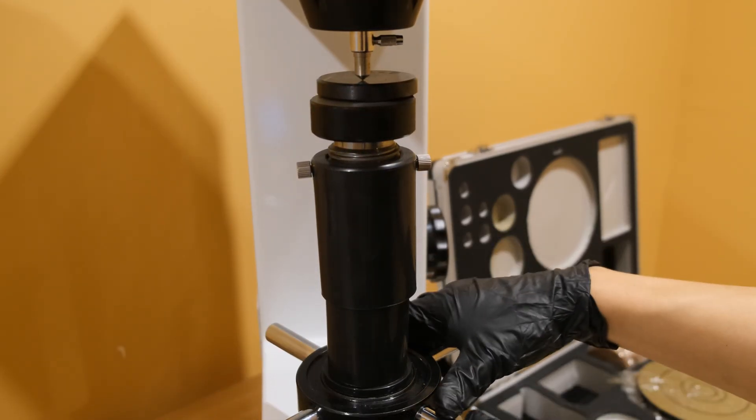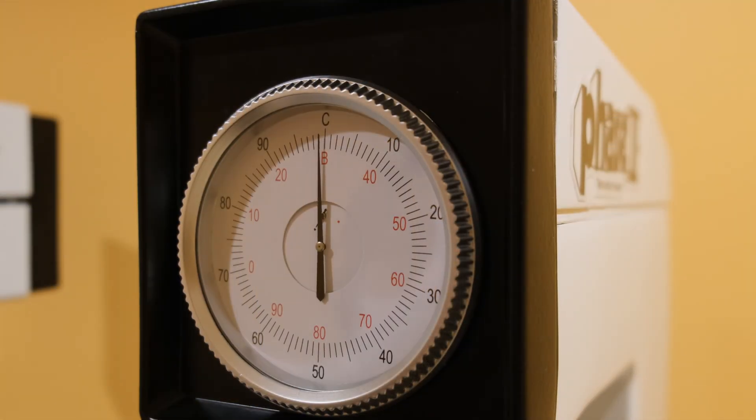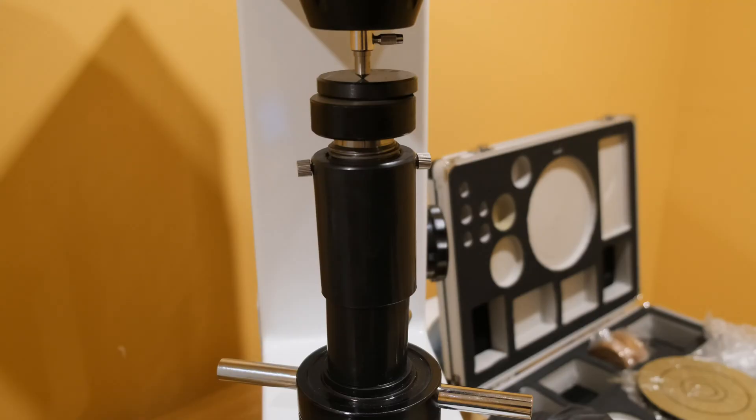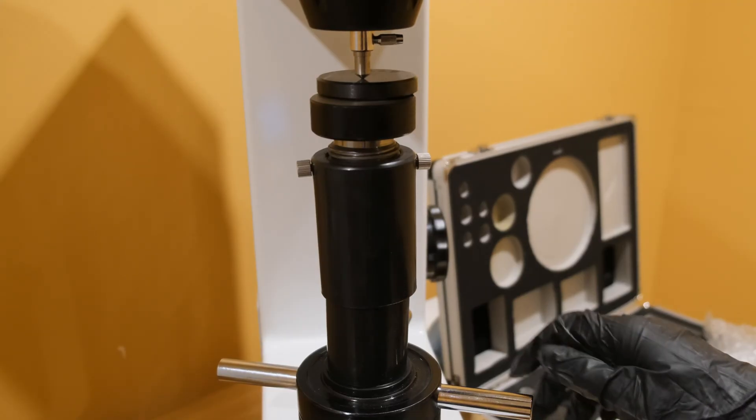Smoothly continue to raise the anvil by turning the elevation screw counter clockwise, paying special attention to the indicator. Once the needle completes three rotations, bring it to a stop on or just after top dead center. Adjust the indicator as needed by spinning the outer ring such that the zero mark is in line with the needle.